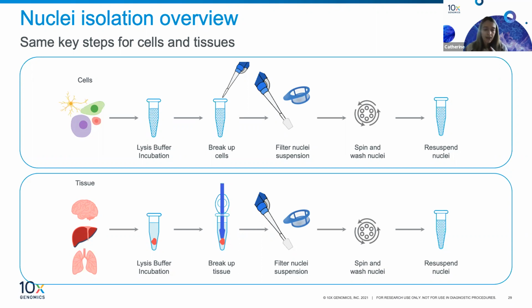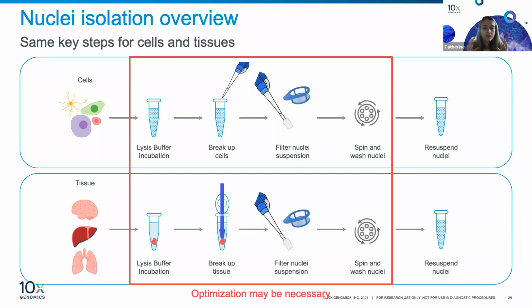Although the steps are very similar here, there's definitely going to be optimization required of these steps for your sample. You do need to optimize your lysis conditions so that you are getting high quality nuclei and not over lysing.